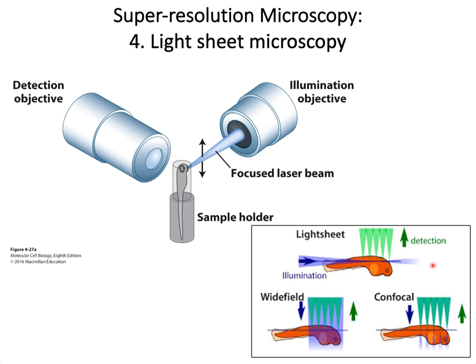You can think of it as a CT scan or MRI scan imaging of a patient, where the sampling of the tissue is done in sectional planes. The same way, in light sheet microscopy, a plane of the sample is illuminated, and each point on the plane can emit a fluorescence emission spectra to the detector. The plane of the laser illumination or light sheet is changed very rapidly through the sample, so the fluorescence emission spectra from each plane is collected to give an overall 3D image of a rapid dynamic event throughout the depth of the sample.